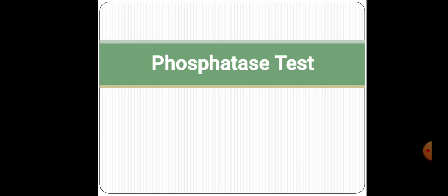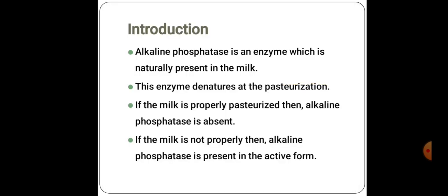What is phosphatase? Phosphatase is an enzyme that removes the phosphate group. That's why it is known as a phosphatase test. Here, alkaline phosphatase is used to check the quality of the milk.